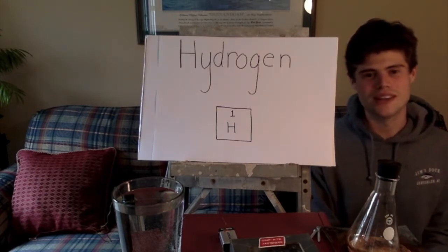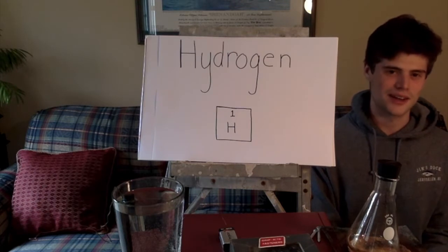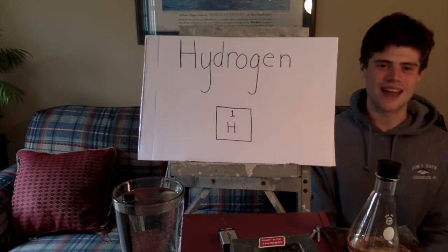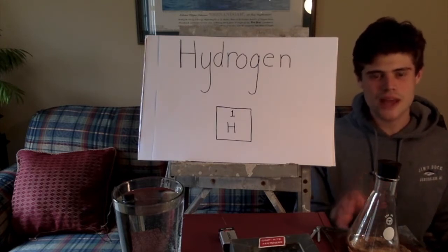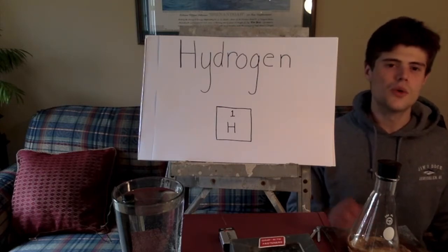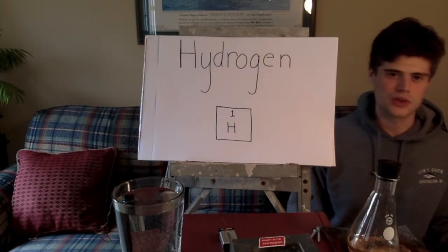Also, if you've ever heard of the Hindenburg disaster, it was a very large blimp filled with hydrogen that exploded. So we're not going to do anything that dramatic today, but we are going to make some explosions here in just a moment. So I'm going to set up for this first experiment, explain how it's going to work, and also we're going to use the reaction equation to understand exactly what's going on with this chemical reaction that we're going to create. So you'll see that in just a moment here.